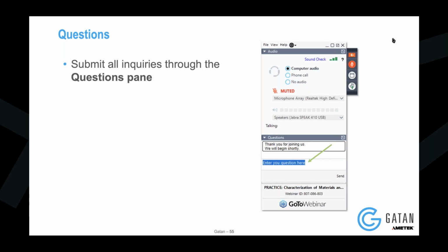So one of the questions I thought might be useful is for people who are new to ptychography or haven't done ptychography: is ptychography essentially a computational processing technique to improve the quality of the high resolution images that you are getting, rather than something that you can do by altering the electron beam or the actual acquisition? That was one of the questions that we got. If you could maybe give a little more context about how we can use ptychography.